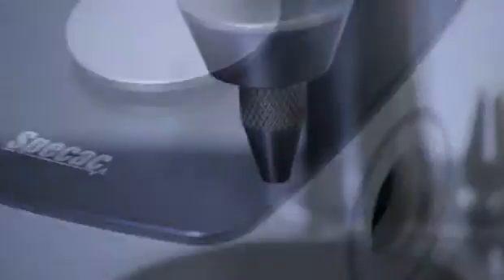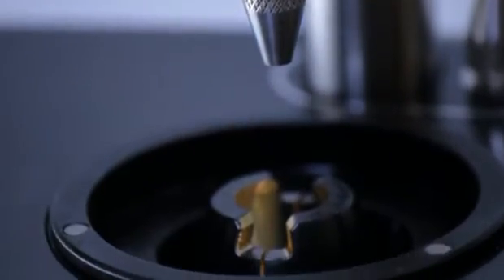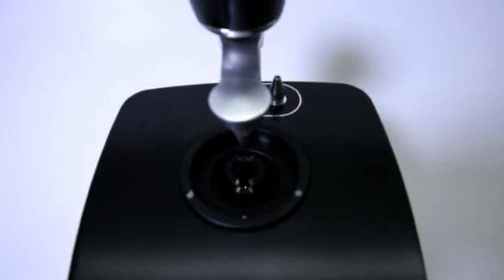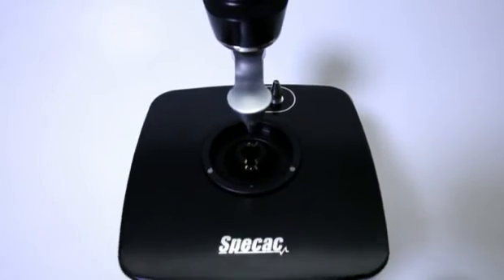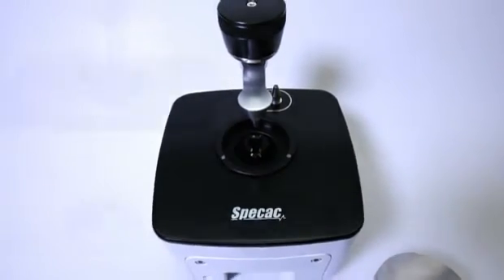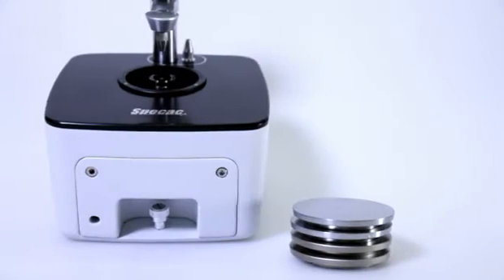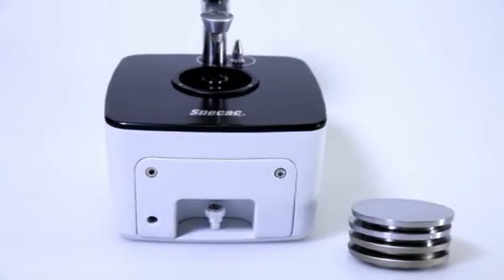The Quest ATR accessory is a performance single reflection ATR accessory from SPECAC designed for routine quantitative and qualitative analysis of solids, liquids, powders, paste and gum-like samples.